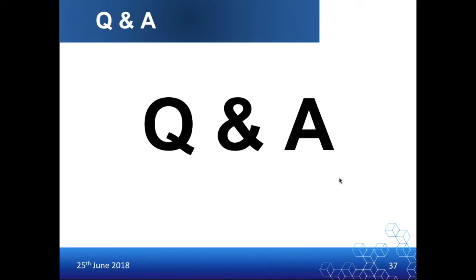Right. So there's loads of questions coming. I'm just trying not to repeat any, so that's why there's a little bit of delay. The next question is from Kevin Kelly. The question is, how do you measure transepithelial resistance, TEER? Is the system opened or do you sacrifice samples? Is there any integrated TEER electrode? So there's quite a lot in there. Let's split the question. How do you measure a transepithelial electrical resistance?